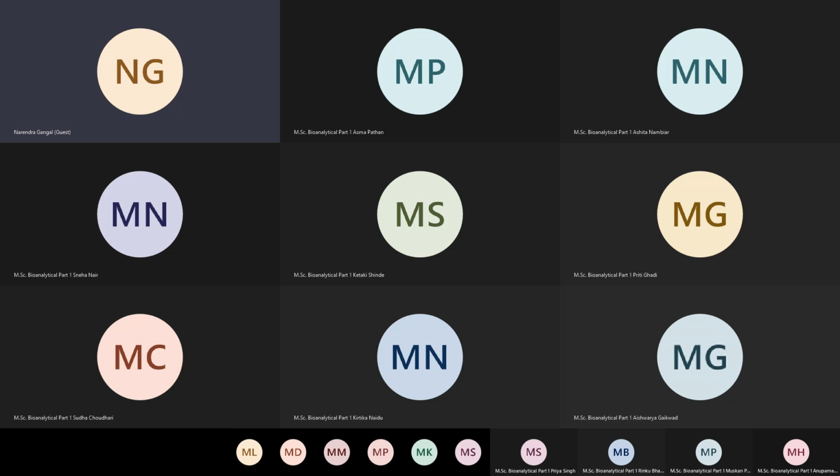When it is atomic absorption, it's absorption spectroscopy, whereas ICP OES is emission spectroscopy. Today we are not going to discuss ICP as an OES technique; I am going to discuss ICP as a source, the ionization source.